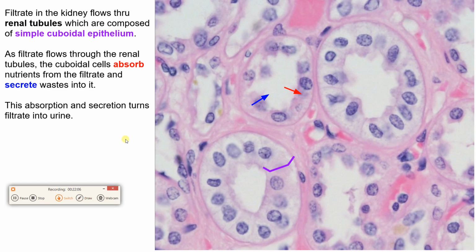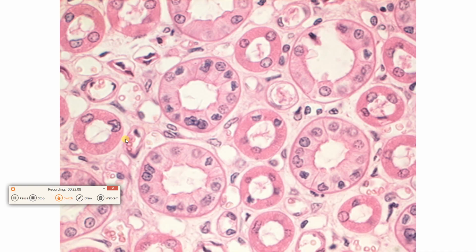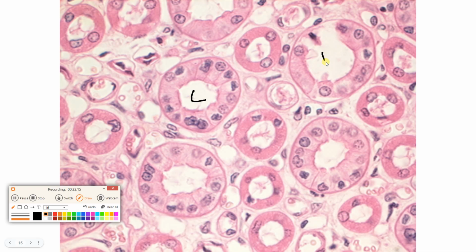We're moving on. Got some more renal tubules here. Can you see them? Can you see all the lumens? So lumen, lumen, lumen, lumen, two, and lots more. I'm just not doing all of them. Cells around the lumen, one row of nuclei, generally circular-ish nuclei, simple cuboidal epithelium. These are renal tubules. If ever I'm seeing little tubes in cross-section, I know they're renal tubules.